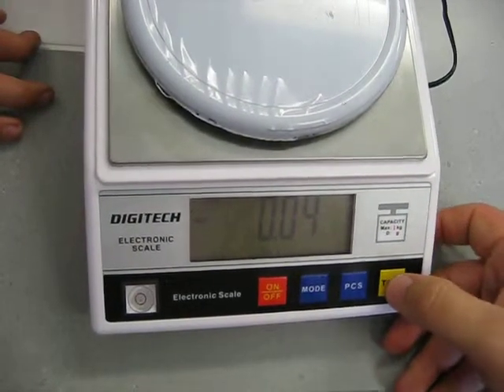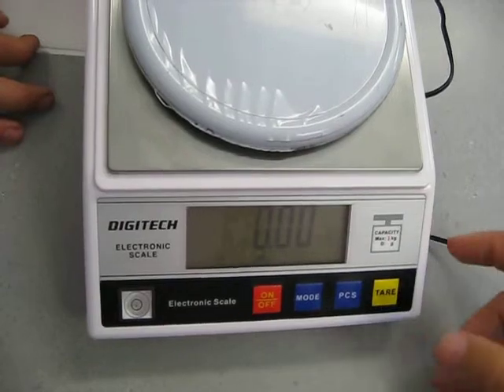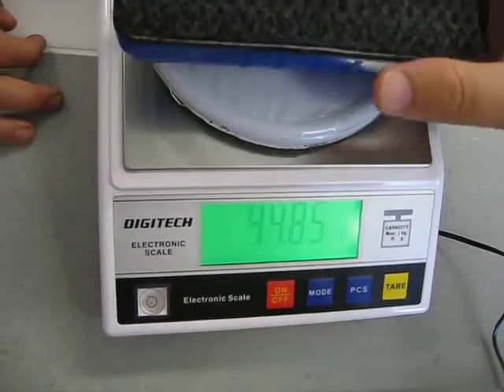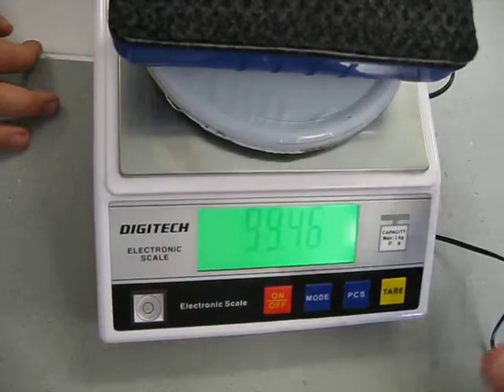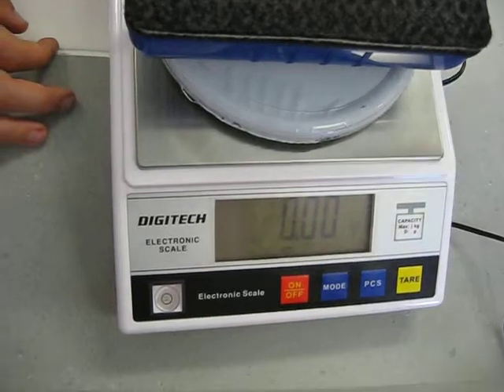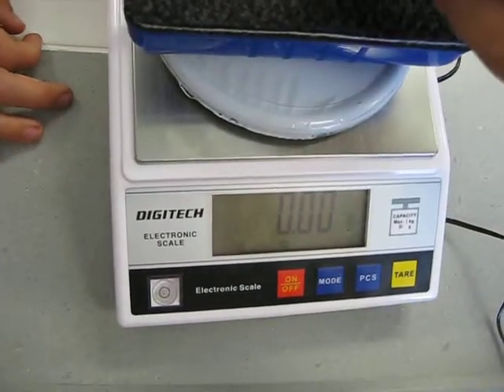The tare button just here is how you reset it to zero. If you've got something on there that you're using as a bowl but you want that bowl to weigh zero, press tare and it sets it back to zero. So you only measure what you put on top of that now.